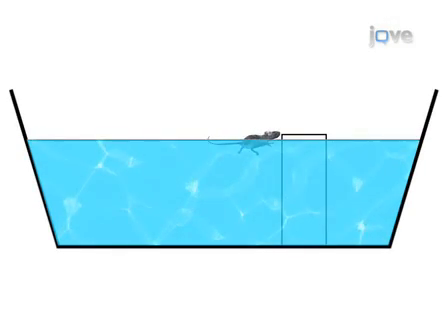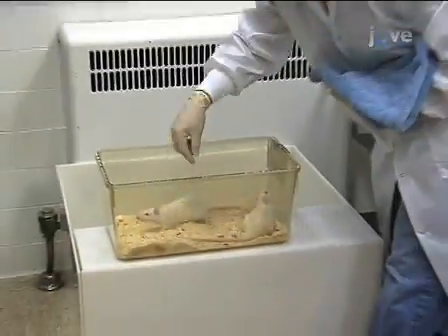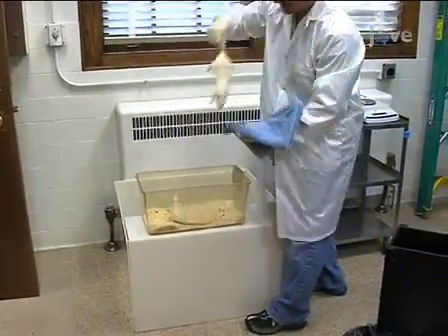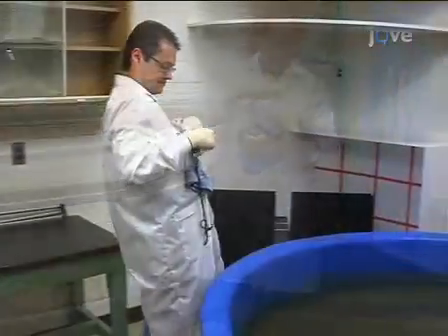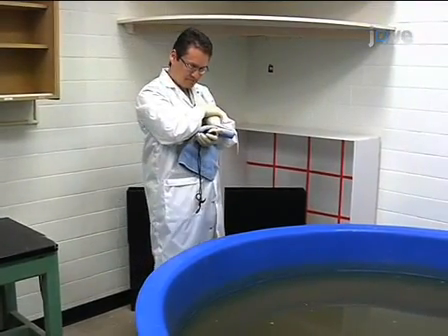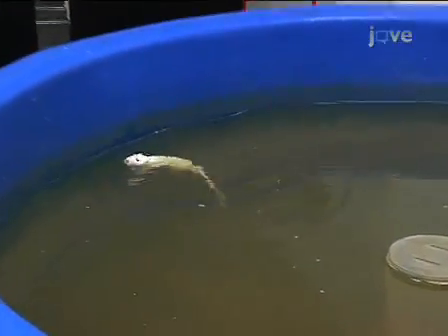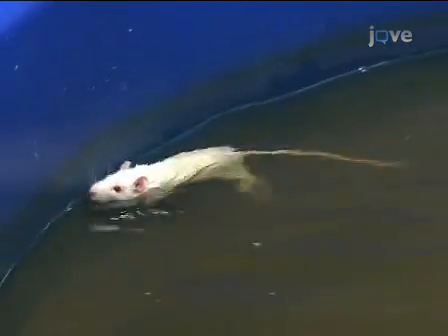Now we are ready to begin the training of the animals in the water maze. The water maze has four starting positions: north, south, east, or west. Take the animal to one of these positions. Lower the animal to the water by supporting it with your hand and bringing it down gently into the water, tail end first. Do not stress the animal out by dunking its head in the water.